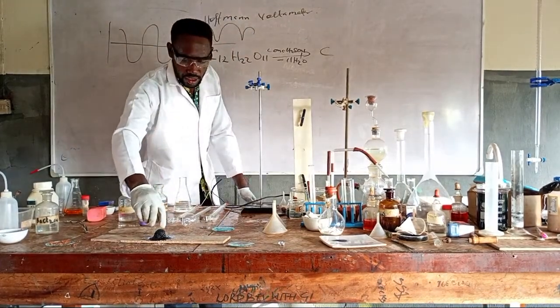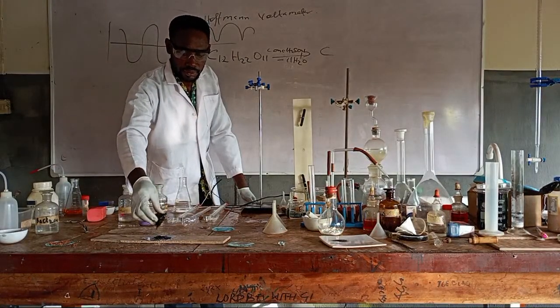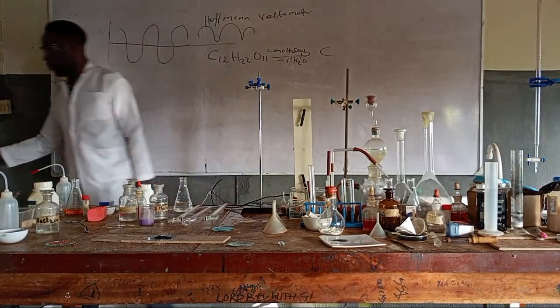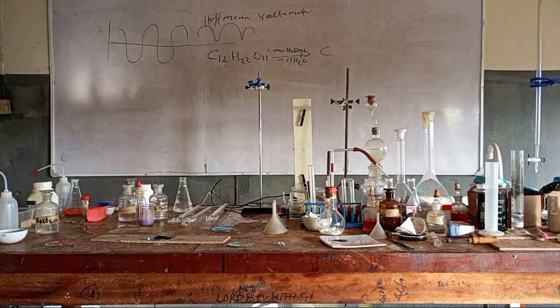So it is still hot. So that's charcoal, sugar charcoal. It is still hot. Be careful. So those that say they are not smelling anything. That's smelling like what? Charcoal.